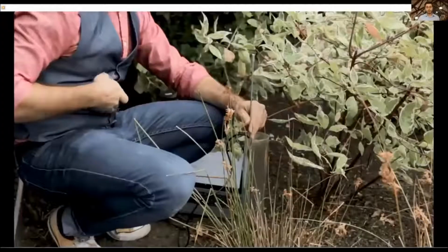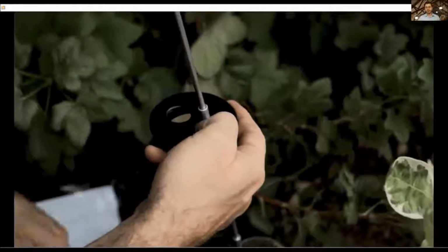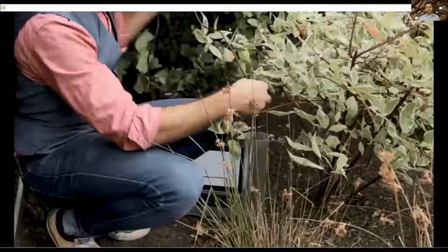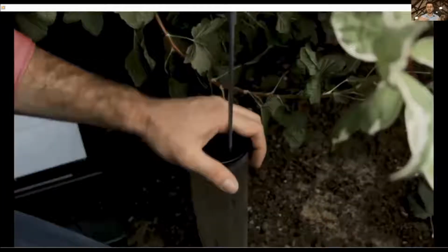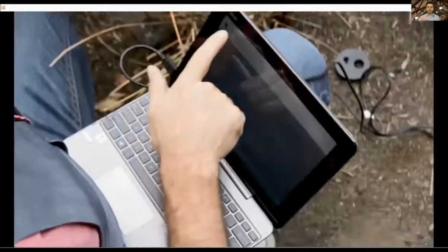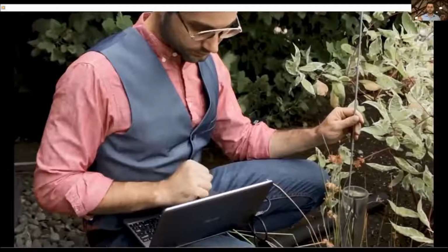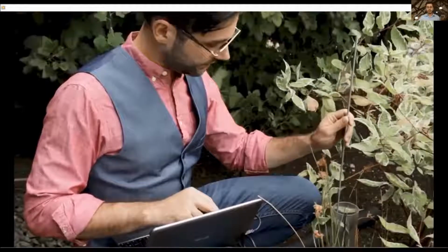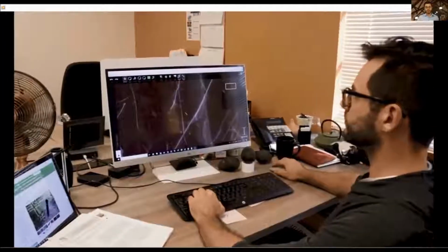And here, we're actually putting the locking cap on. You use this locking cap to make sure that different environmental effects, UV, moisture, aren't getting down into there and changing the environment, as well as you can actually lock it in place with the slider rod and change the depths that you're using it at. And to scan, it's pretty quick.